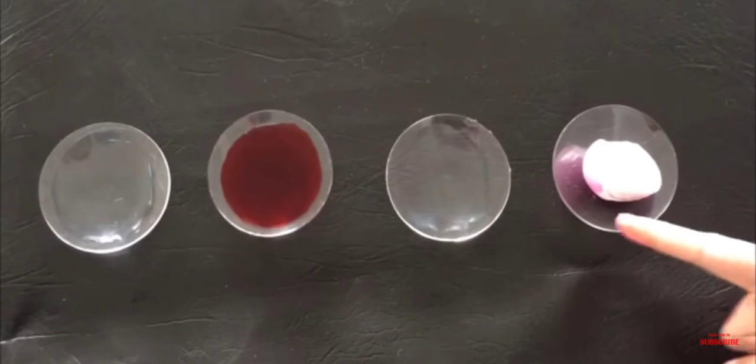So in order to save time, we are going to perform the two activities together. For this we need one onion. In the second watch glass we need a little water. In the third watch glass we need safranin, for observing the nucleus. If we don't want to observe the nucleus, we can do the second activity without stain also. That is, only the outline of the cells we have to observe. So instead of safranin, if we use methylene blue, then the nucleus can be observed more clearly. And in the fourth watch glass we need glycerin.